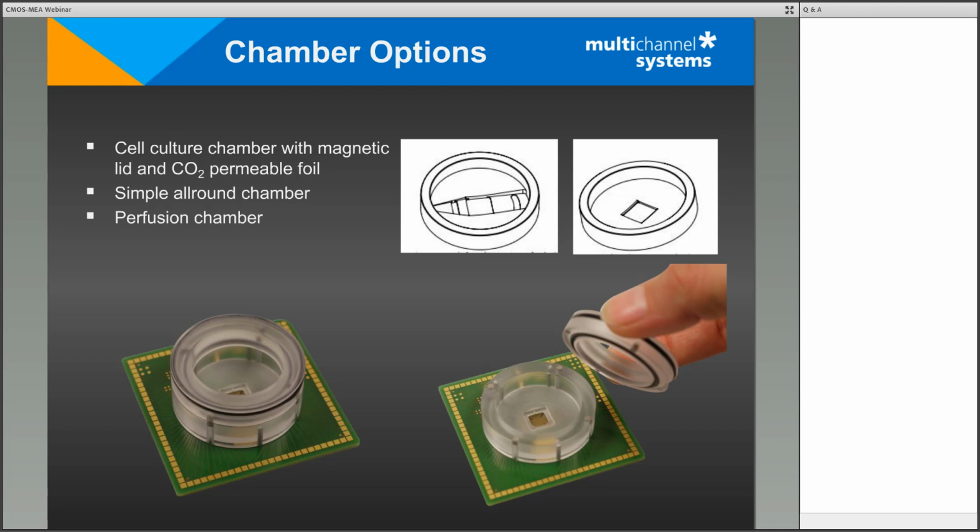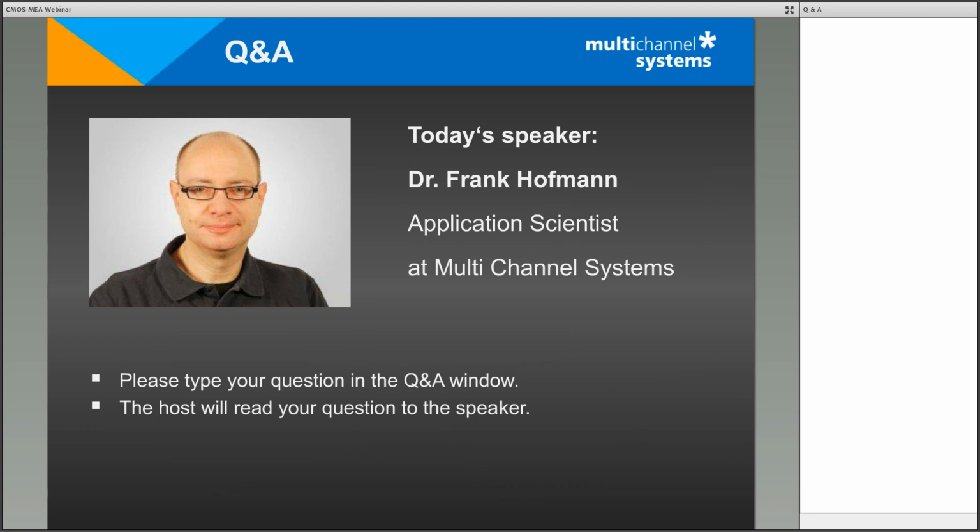The last question was for the computer specifications. You mentioned that that's quite a challenge. Yeah. So actually, I did run the system on a laptop for demonstration purposes, but that's really a stretch. To actually work with the system, you need a very fast computer, a tower PC with an Core i7 processor we recommend.